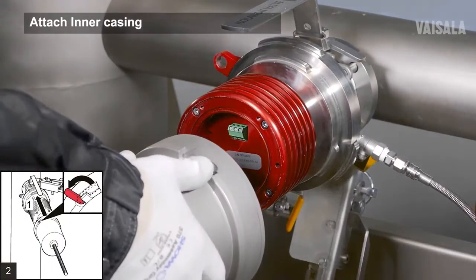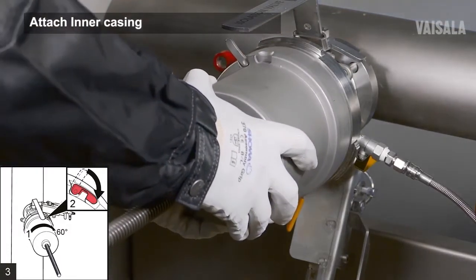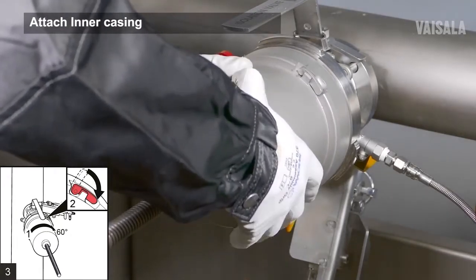Lift up the latch of the inner casing to unlock it. Lift the inner casing over the sensor head. Rotate the inner casing 60 degrees clockwise to lock it onto the flange.